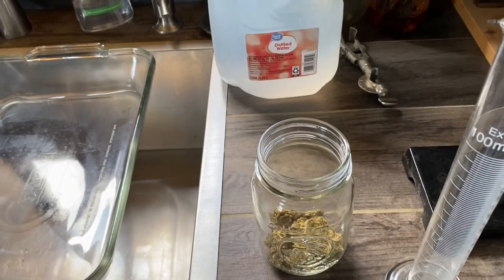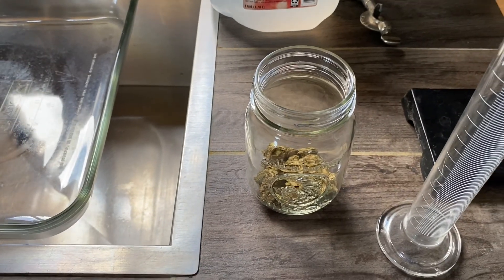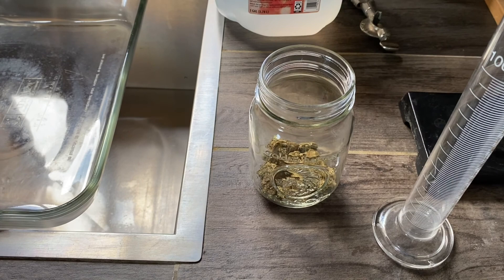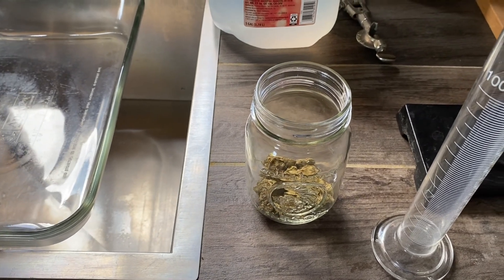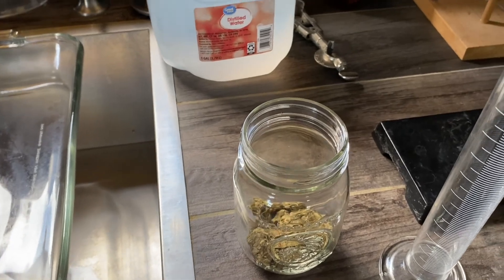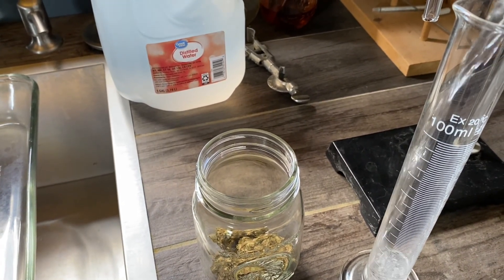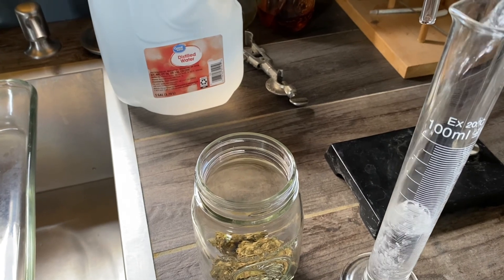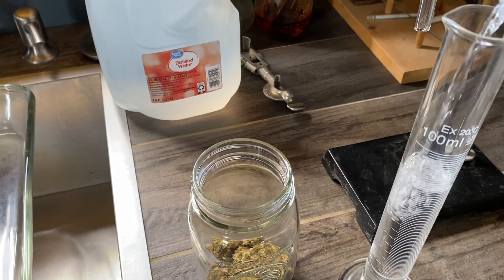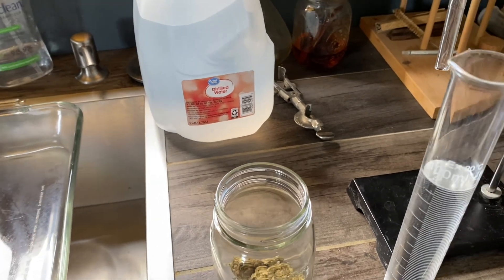We're going to add enough ethanol to thoroughly saturate and have a little extra leftover. I'm going to measure the ethanol as I go so I'll know how much generally to add. We'll start with 100 milliliters approximately — it doesn't have to be dead on.